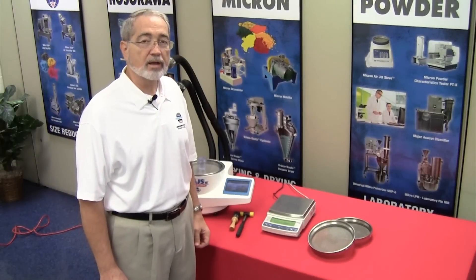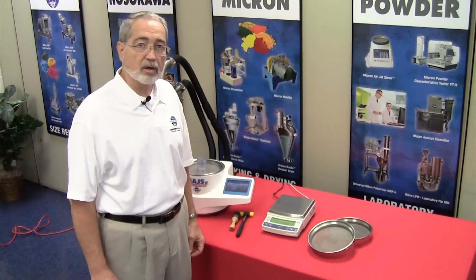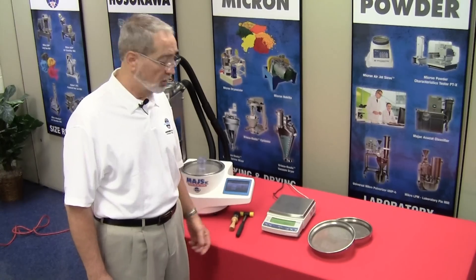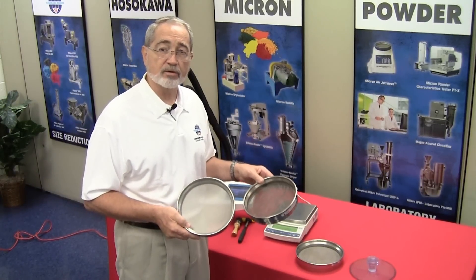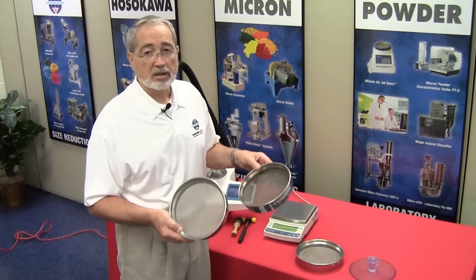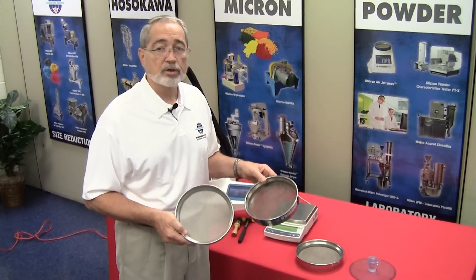Accurate weighing is critical in the analysis of dry powders. Hosokawa Micron Powder Systems can offer a compatible balance. Sieve screens are available in the 20 micron to 4750 micron range. If you're familiar with mesh sizes, that's 635 mesh to 4 mesh.